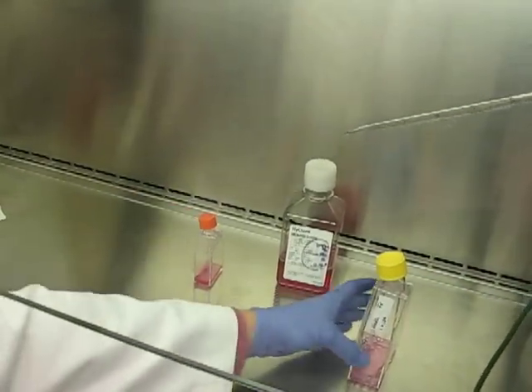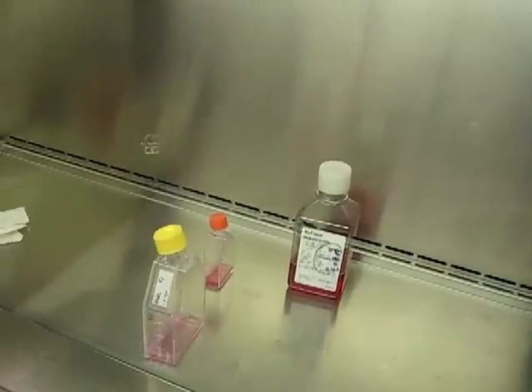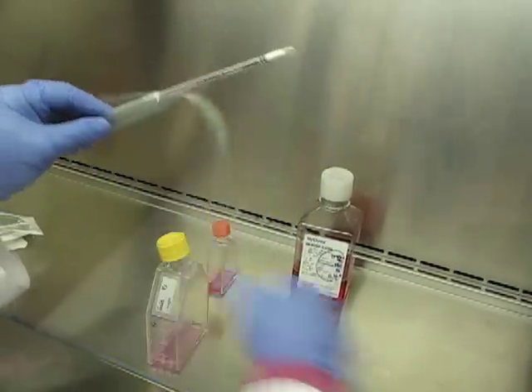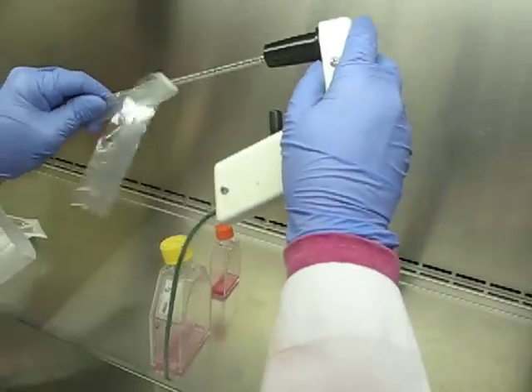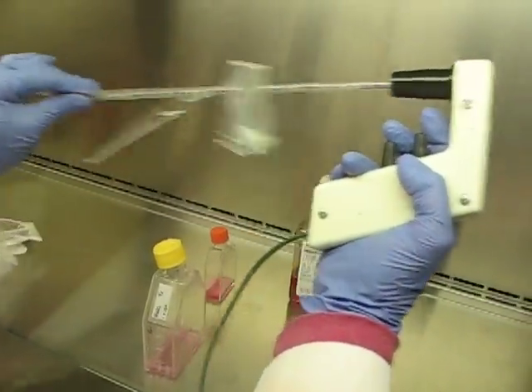Okay, so that's all ready. Now I've got a two mil pipette here to pipette my one mil. Turn that scale so it's facing you.